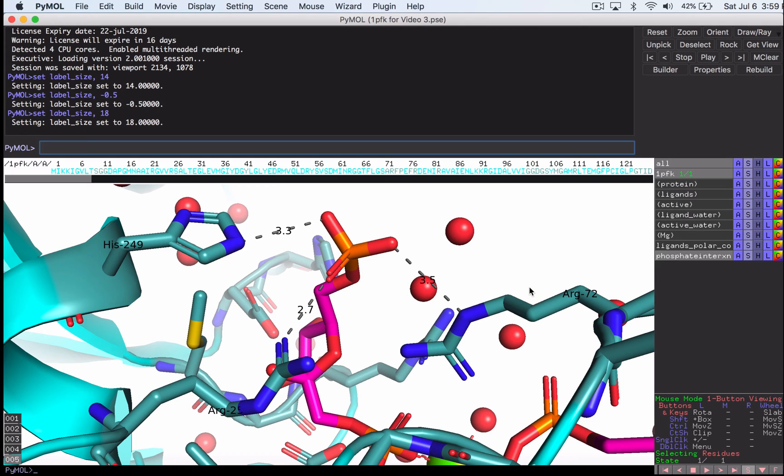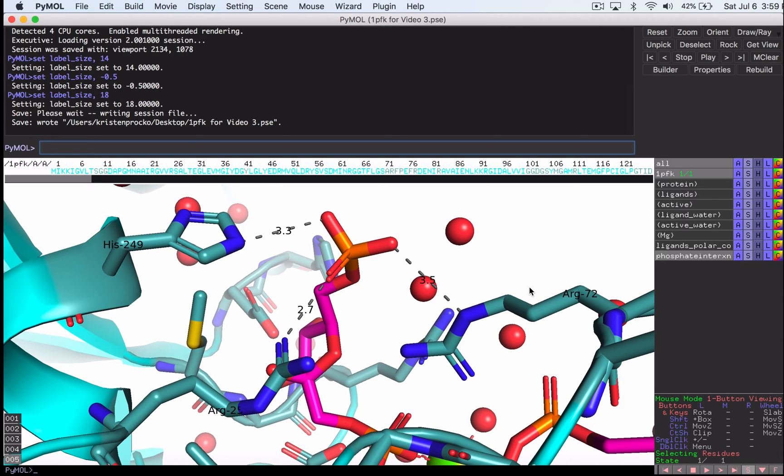Now save your work. We are going to enter edit mode and edit mode can do some crazy things. If you click on the chain, you could actually move the protein chain and I've never been able to undo that once that happens to me. So save and prepare to have to close your file and start this part again.